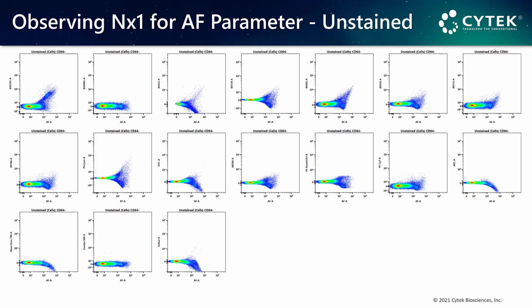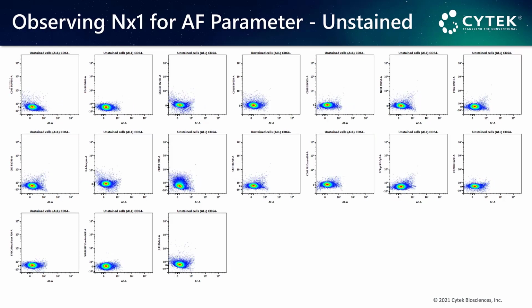And as always, the place we look for guidance on understanding if our unmixing choice is a good one is by looking at the autofluorescent tag versus every other fluor in the unstained sample. Again, as we saw before, here we see considerable sample heterogeneity and significant unmixing error when we do autofluorescence extraction without any additional AF tags. But when we incorporate the tags examined a moment ago, we see much improved unmixing, as the unmixing algorithm has now been instructed about the variable AF signatures within the sample by us providing additional reference controls from the unique portions of that unstained sample.